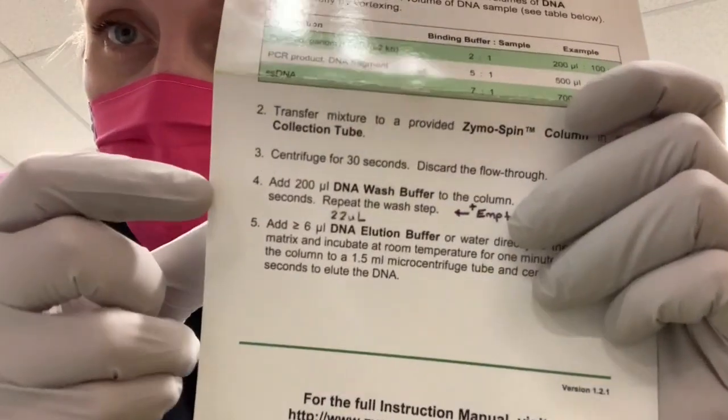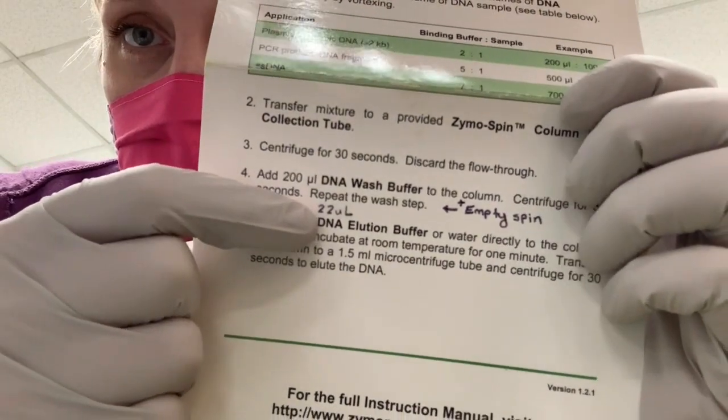And as I mentioned, the DNA will stick to the filter in the column until the environment changes. So there are salts and ethanol that keep the DNA bound to the filter in the earlier steps, but at the end, when you elute, that DNA gets knocked off and into solution for it to be eluted. This protocol says use greater than or equal to 6 microliters of DNA elution buffer. And there is a little elution buffer in the kit. However, we're not going to use the elution buffer for many of our applications. We're going to just use water. And the reason for that is the elution buffer has certain things in it that are really great for DNA stability, but which are not really great for some of the applications we have for the DNA that we're interested in pursuing downstream.